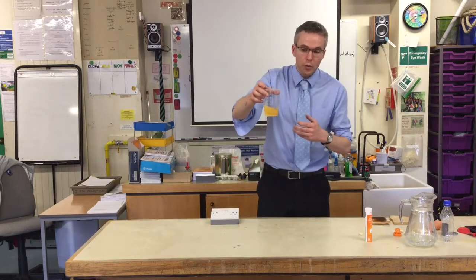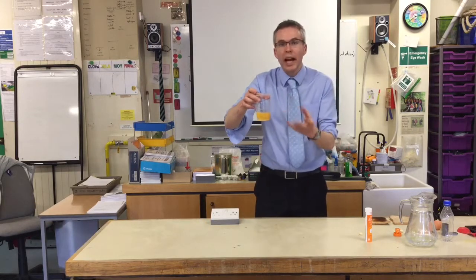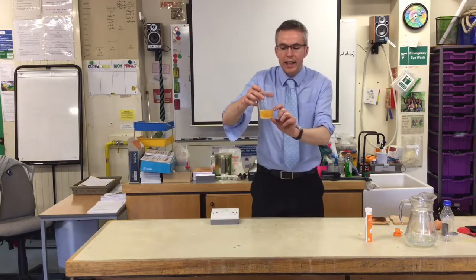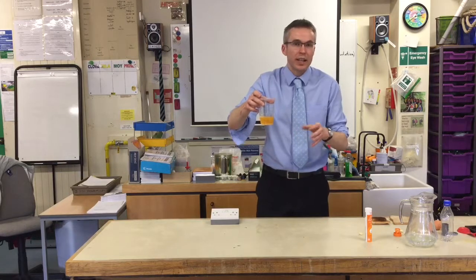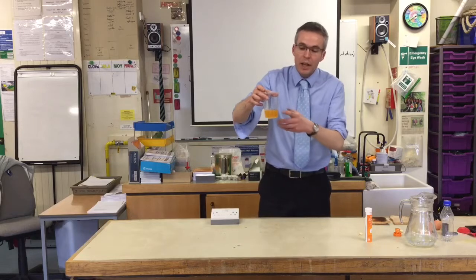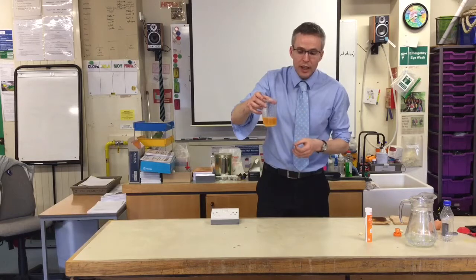You'll notice the water's also turned orange in colour, whereas before it was colourless. And again, that's an indication that a chemical reaction has happened. You might want to point out though that just because a colour change occurs, it doesn't always mean a chemical reaction has happened. For instance, if they took, say, diluting juice and put it into water, it also changes orange. So we've got a colour change, we've got a gas given off, giving the fizz. So two signs of a chemical reaction.